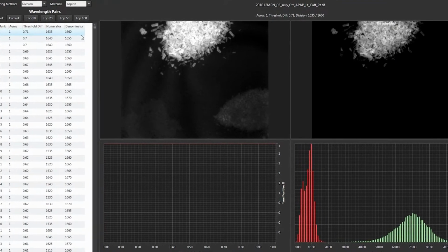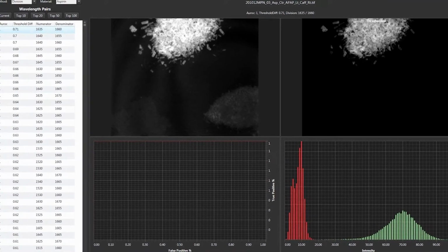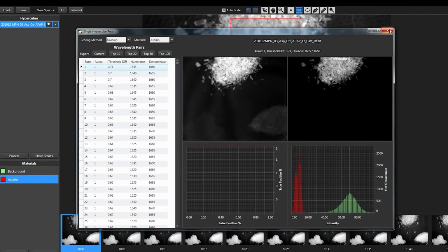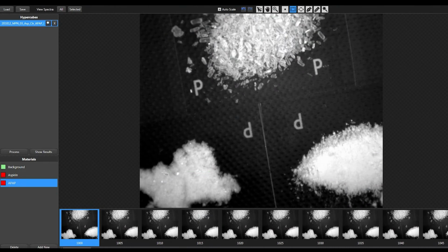Having made notes where the most prominent absorption peaks are, it's now time to select several wavelengths that can identify each of the 3 active ingredients of the Excedrin tablet. While we'll complete this exercise for all, let's look at acetaminophen as an example. Based on our experience, as few as 2 wavelengths can be sufficient for identification. First, we have to tell the software what's what.